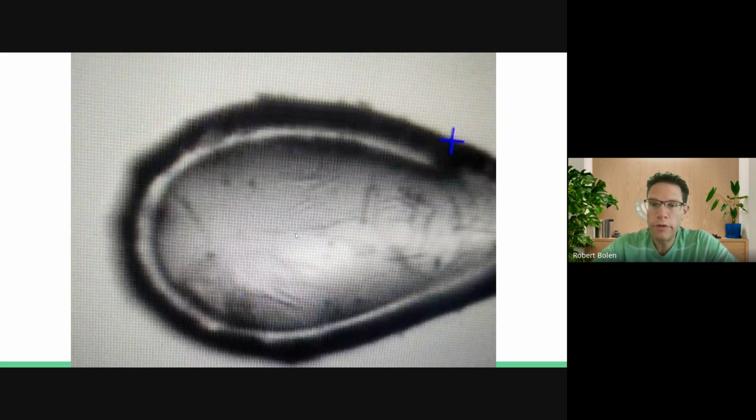And then we do that. You can zoom in real close here. So this is a real close zoom in, and obviously this is not positioned right because the plus sign is up here. So we would not even be zapping any crystals, but this would get moved so that the plus sign is over one of these beautiful crystals. And then we can collect data on it.